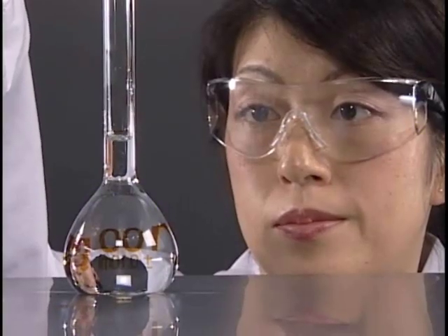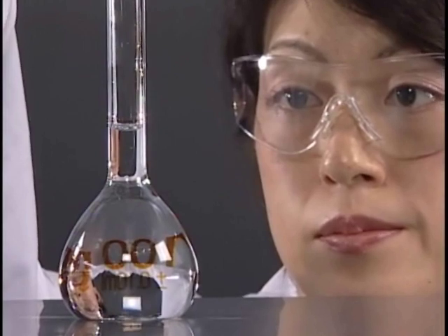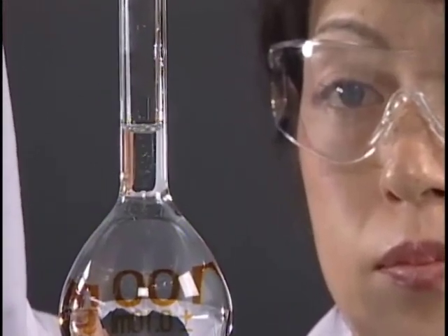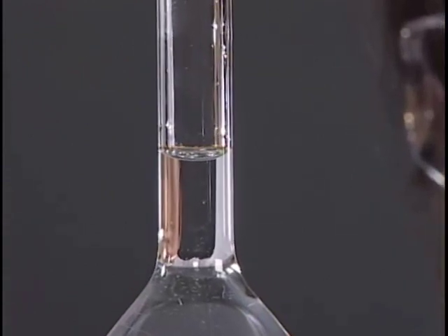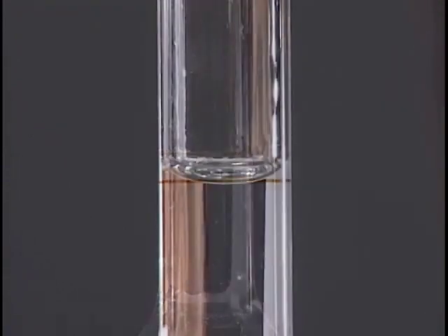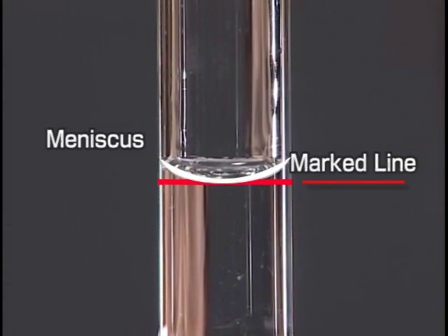First, move your eyes to the level of the marked line of the flask. Then, add distilled water drop by drop with a transfer pipette till the base of meniscus matches with the marked line.